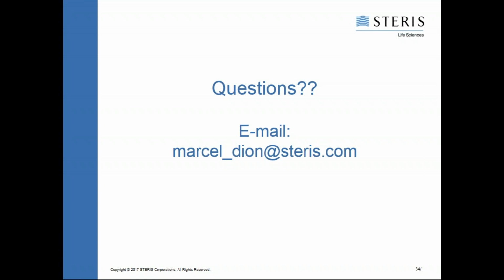Right. Well, that's a very good question. It reminds me that we have similar questions for our washing systems as well, when we're talking about temperature and chemicals and so on. So there are not so many tricks. If there's any doubt around the compatibility of an item with a process, it's to look at the cut sheets or the information you can get from the suppliers of that component, and verify if it will be able to withstand the parameters that it's going to be exposed to.